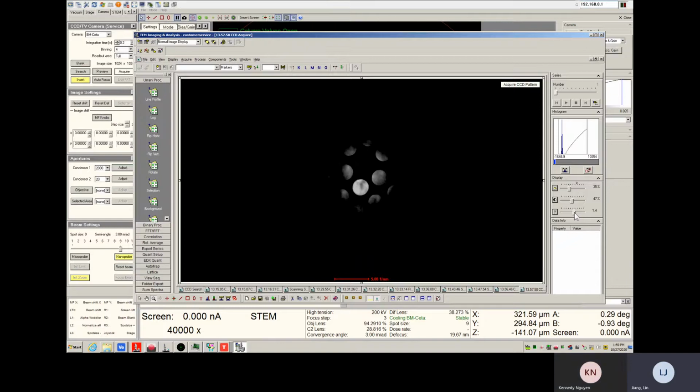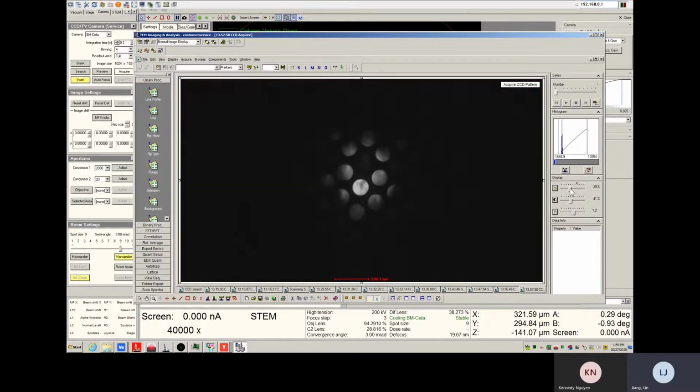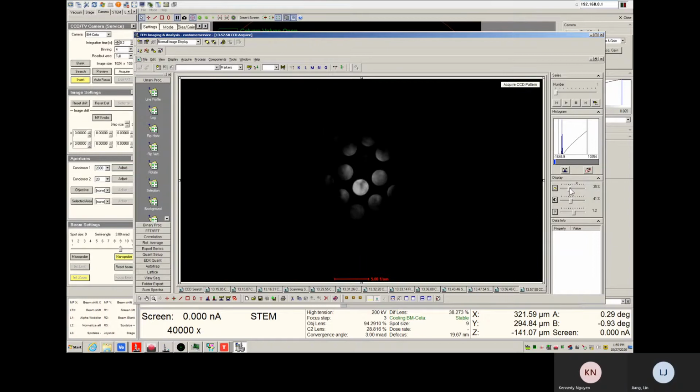You see here, kind of information like X. This indicates you have some strain within your single crystal. Okay. Yeah. Right.